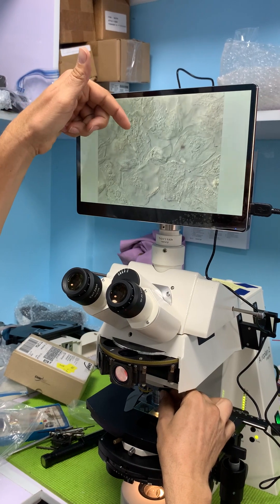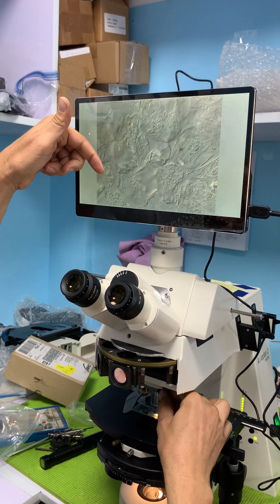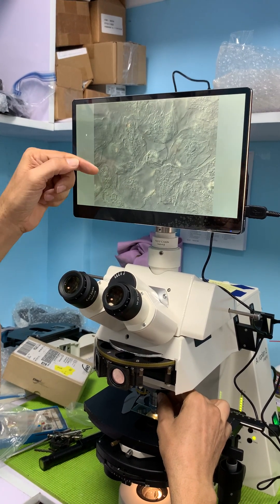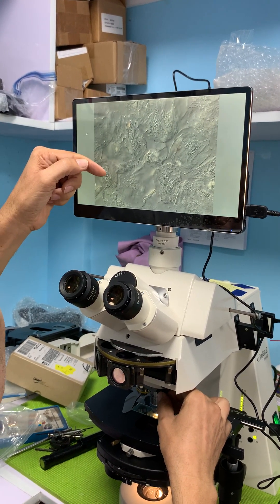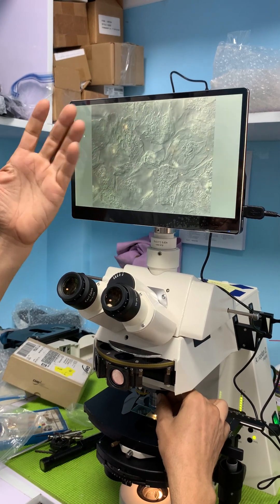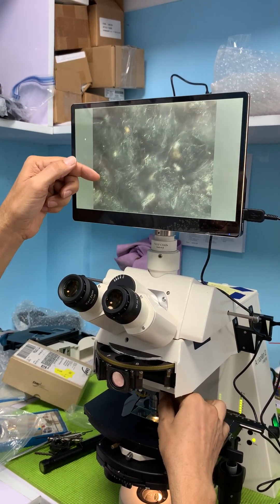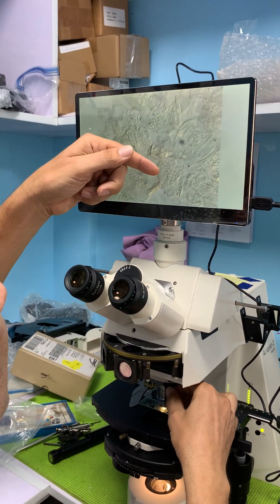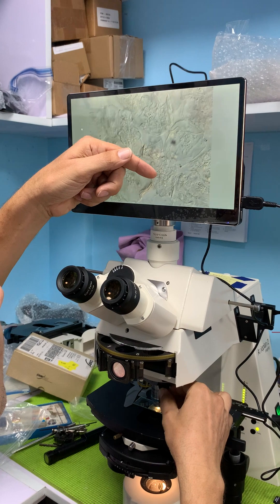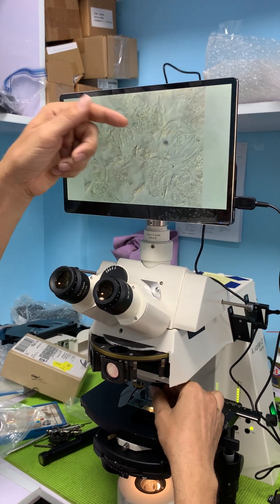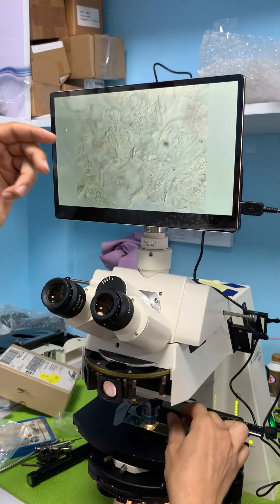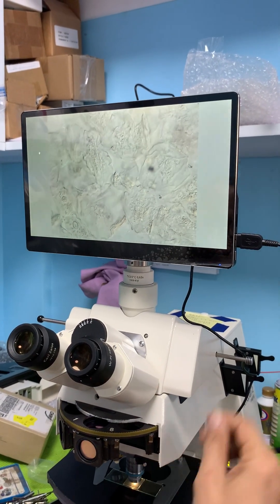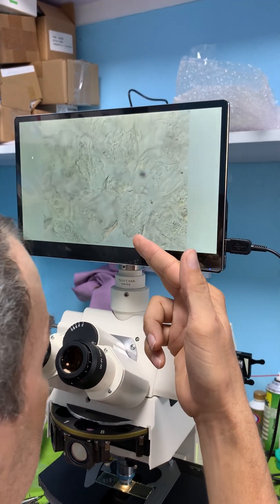As I keep rotating, I'm going to see two things: my shadow shifting from one side to the other, and then through pseudo dark field to the other side — and it tends to be cratering. Here's a good crater, like a volcano. Depending on which side you're on, it's definitely cratered in.